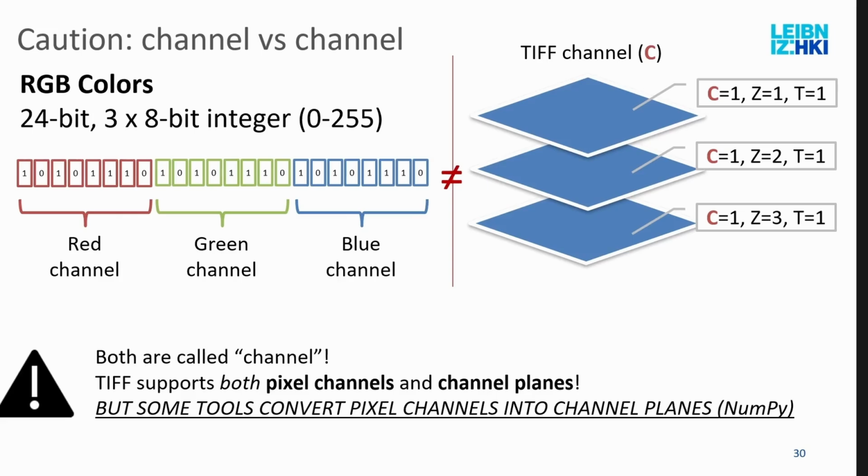But you have tools that cannot handle it properly, and then they do something with it. For example, ImageJ can handle it properly. You will be able to have a 5-dimensional image, X, Y, Z, and so on. That's the ImageJ official order of channels, slices, and frames, and each one can hold an RGB image, which has 3 channels per pixel.